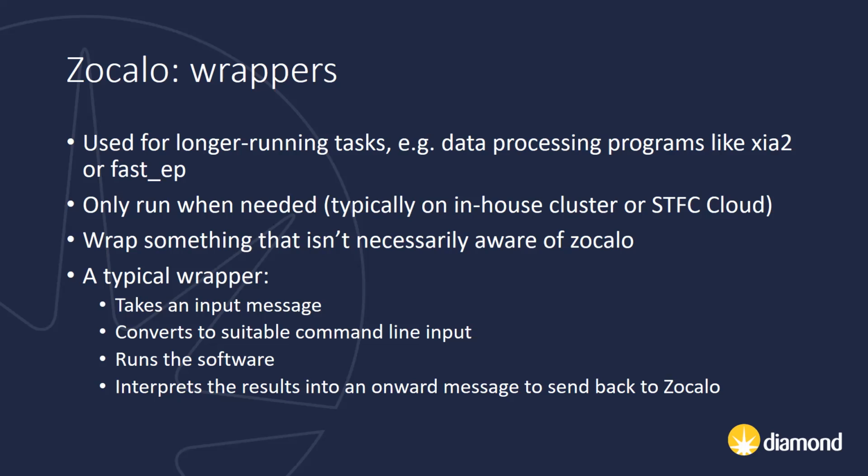They're intended to wrap something that isn't necessarily aware of Zocalo and shouldn't have to be. Something like xia2 or DIALS, they don't know anything about Zocalo, and this is basically a wrapper to enable you to run it through Zocalo. So a typical wrapper would take an input message and perhaps convert it to command line input, run the software, and then interpret the results and potentially send an onward message back into Zocalo, maybe with the results to be inserted into a database, for example.